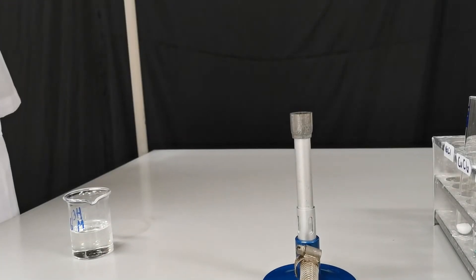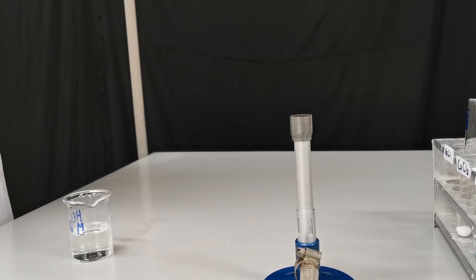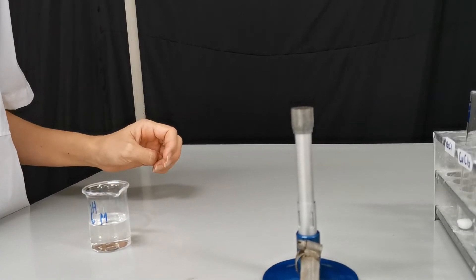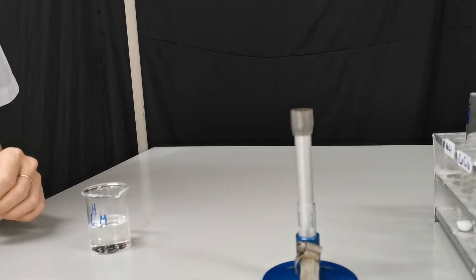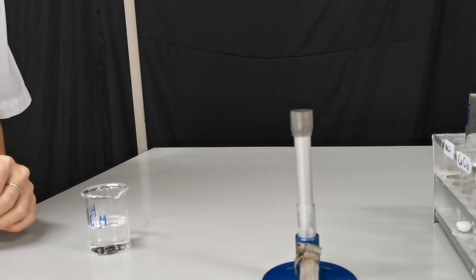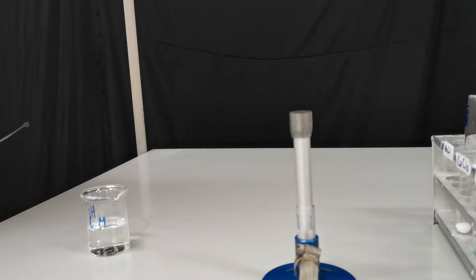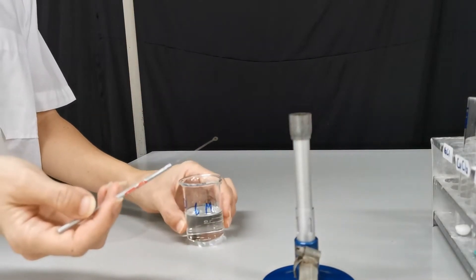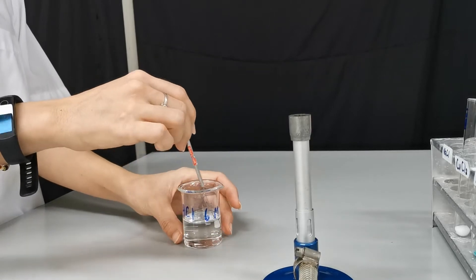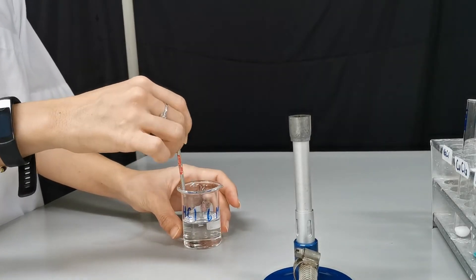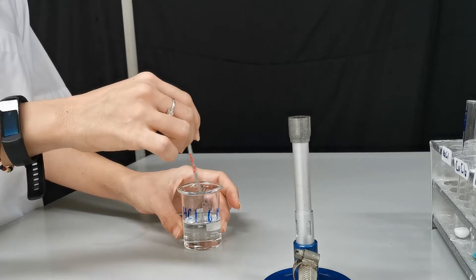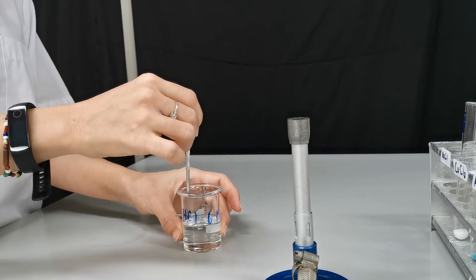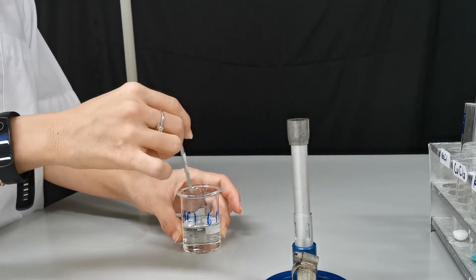Today we're going to learn about flame tests and we're going to test four different ions that are required by IGCSE. These are sodium, copper, potassium, and lithium ions. First we're going to prepare our loop. This metal loop must be washed in concentrated HCl solution. Washing it with acid gets rid of all the impurities and other metal ions that are stuck on the loop.